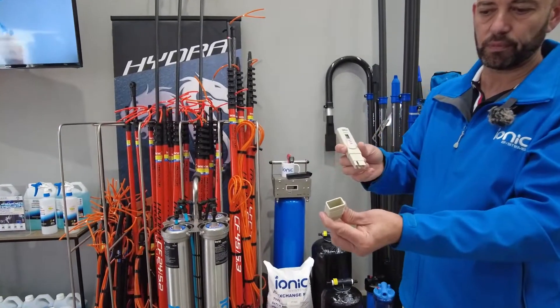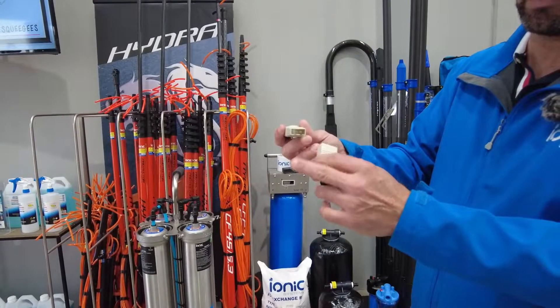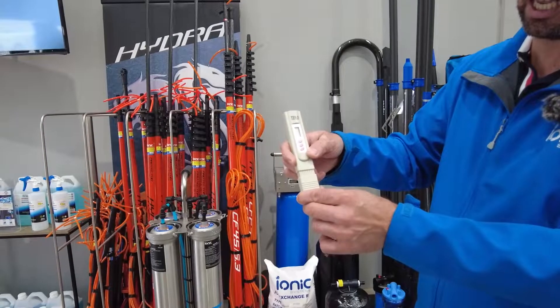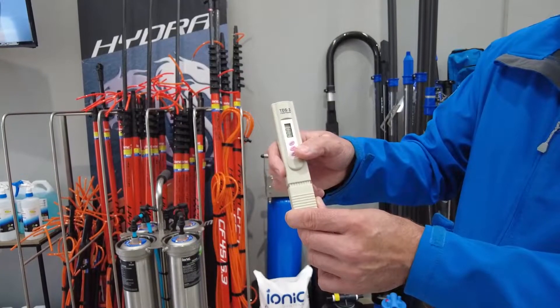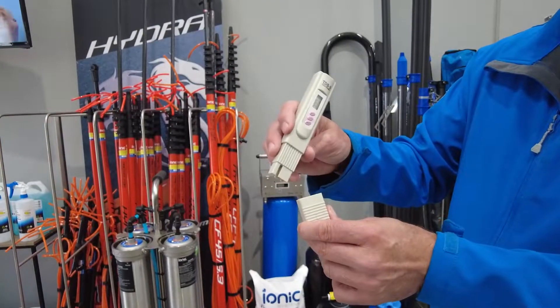How do we use it? Water sample in the cap — two electrical probes. We fill up our water cap, insert the TDS meter once turned on, and the electrical conductors will hit the water and give us a reading.